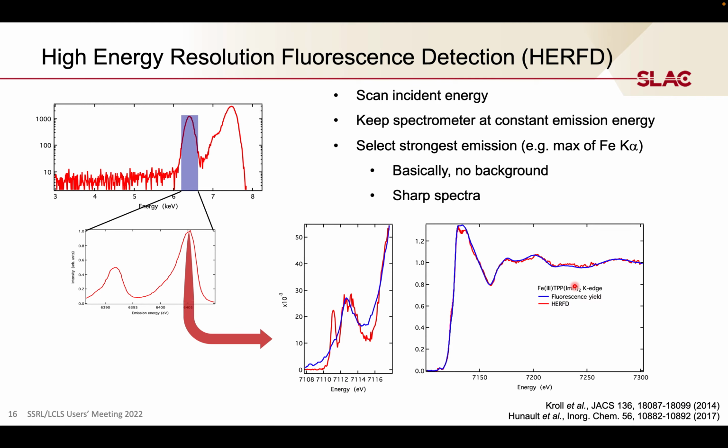So let's start with K-alpha. While the K-alpha emission also has good information, what is very often used is HERFD, high energy resolution fluorescence detection. When you think back to 9.3, a couple of slides before, you do an experiment and you detect the K-alpha signal with a germanium detector, which has an energy resolution of around 200 eV, you would get a spectrum somewhat similar to this.